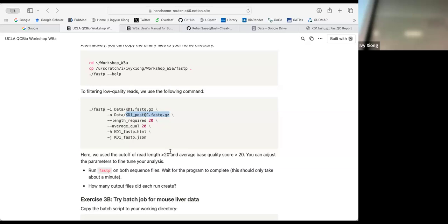What we are doing here is the bigger sample. I think after the shots, yeah, we can try this.